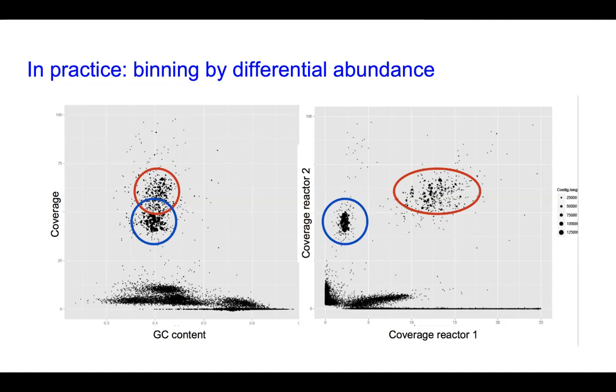This is another thing where the 16S, or the ribosomal operon, suffers. This is often present in more than one copy, and therefore will have different abundance than the rest of the genome and is likely to get lost.